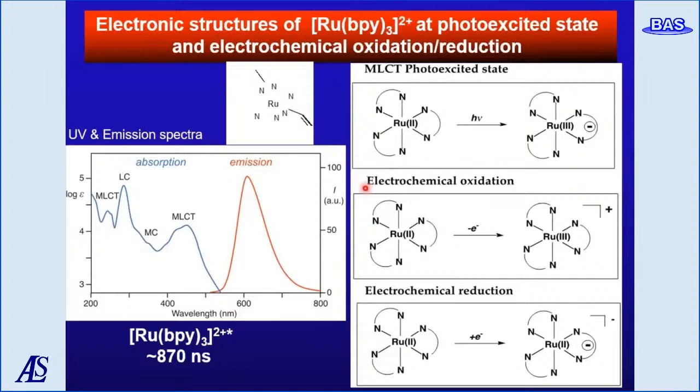The optical absorption is the charge transfer process from the central ruthenium to the peripheral ligand. On the other hand, in the electrochemical redox process, the oxidation occurs at the central metal ruthenium from the 2 to 3 state, with no significant effect on the peripheral ligand. In the reduction process, the reduction takes place on one bipyridine ligand, and 3 redox waves are observed in CV due to the sequential reductions of the other 2 ligands.